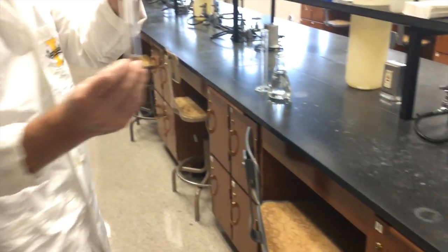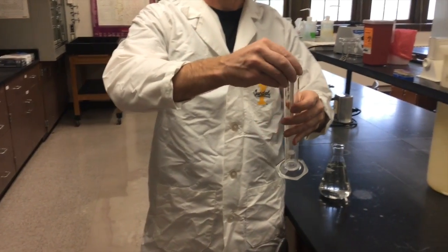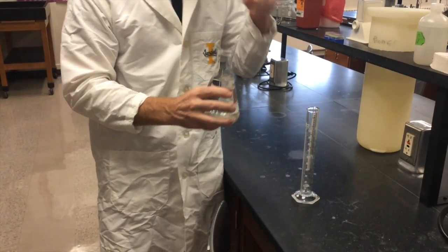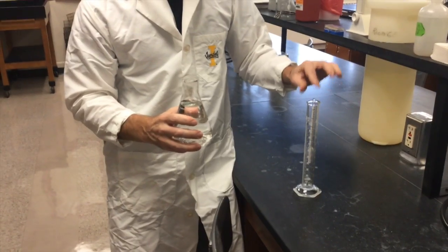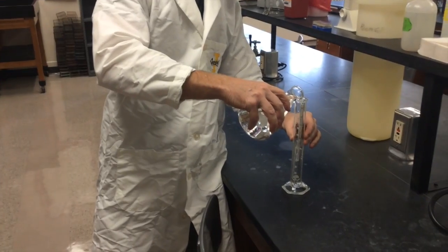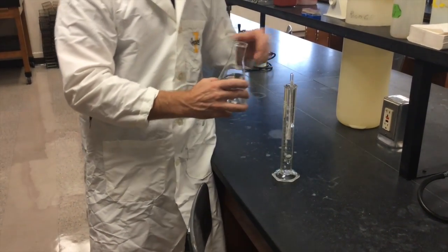So to operate, it's very simple. You first insert the triple scale hydrometer into a cylinder, and then you pour the liquid that you're measuring into the cylinder until the meter itself floats freely. I'm just pouring in distilled water here, so it'll take a lot for it to float.